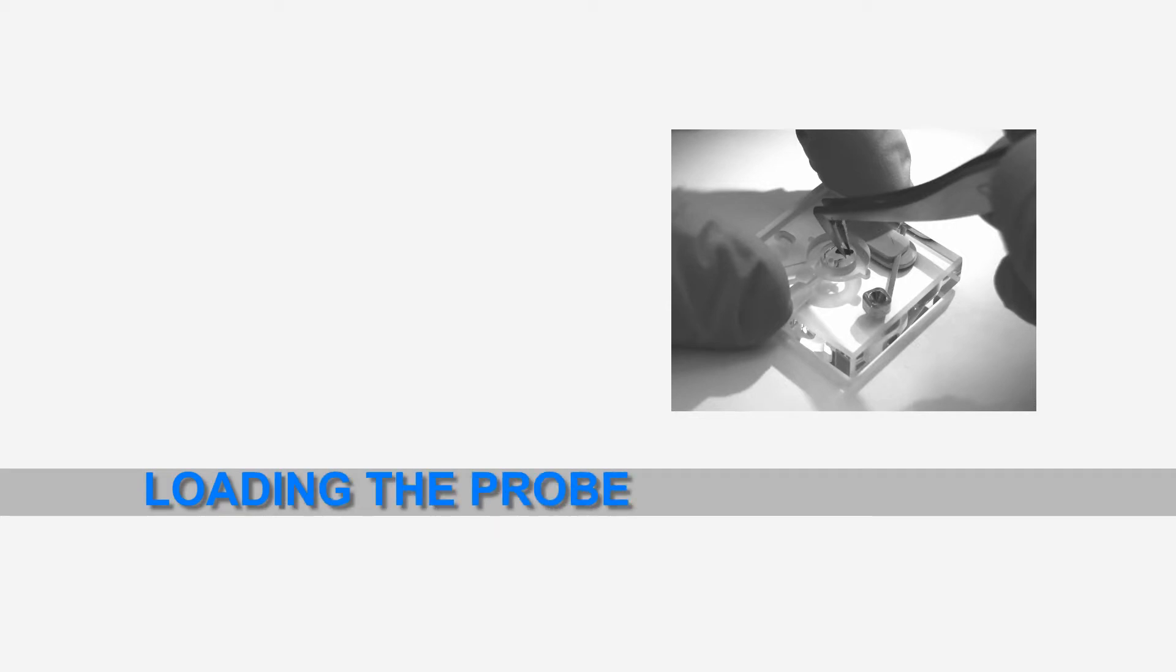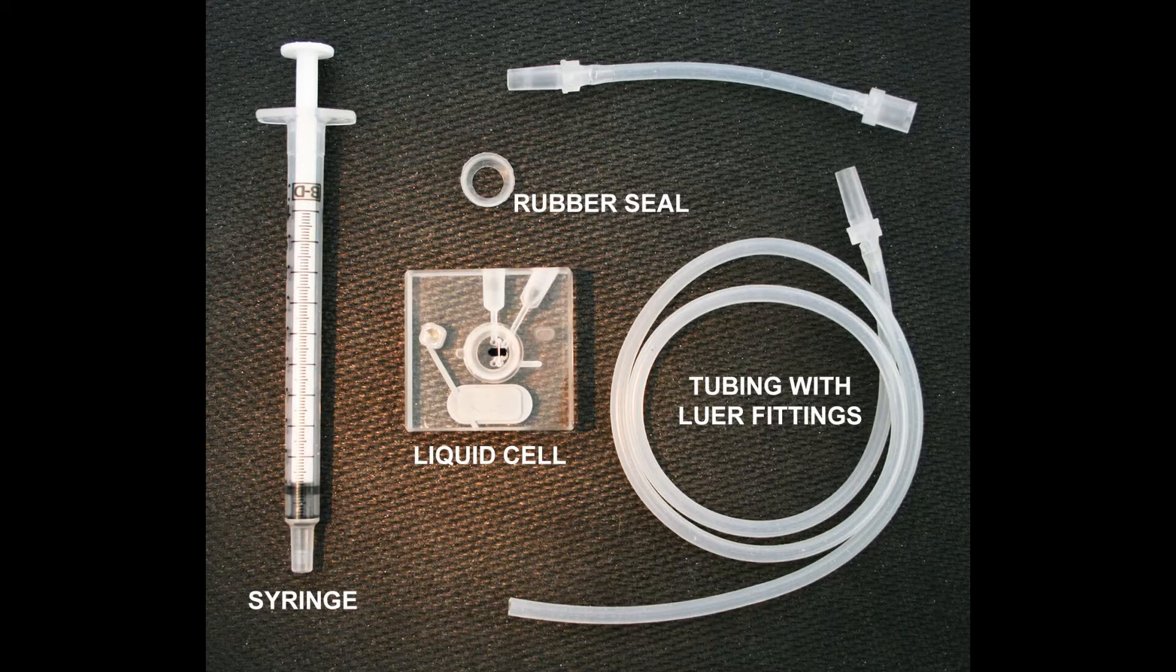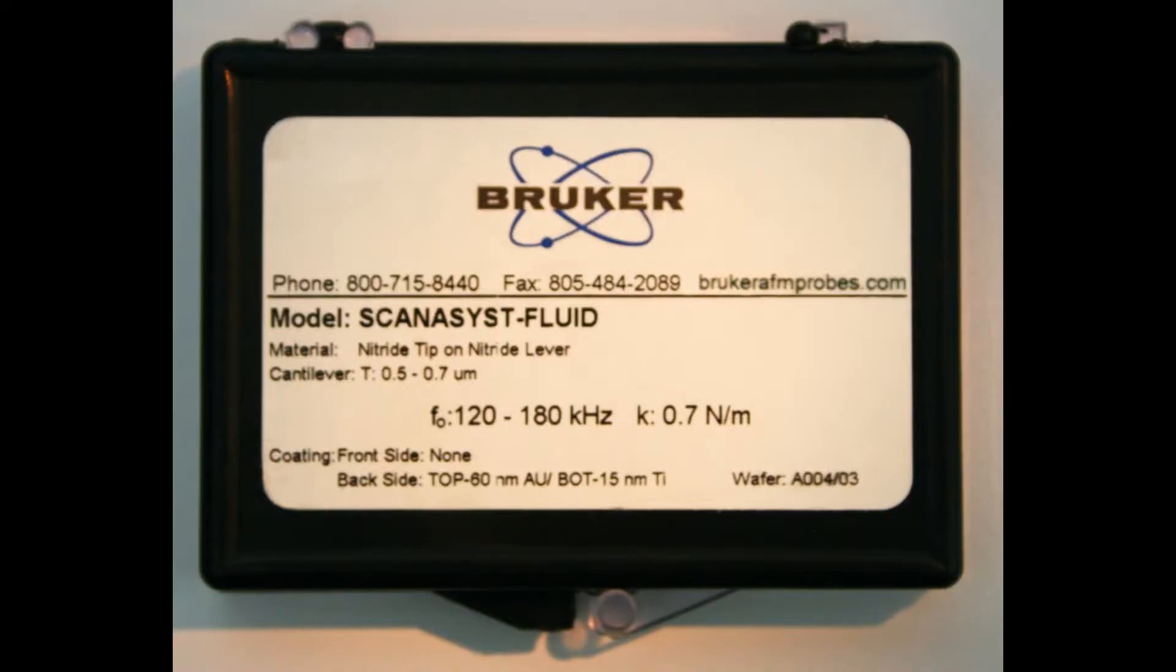Imaging in fluid requires a probe holder designed to contain a liquid environment and a sample. The multimode fluid cell is shown here. These are the contents of the liquid imaging kit. The scan assist liquid probes are shown here.